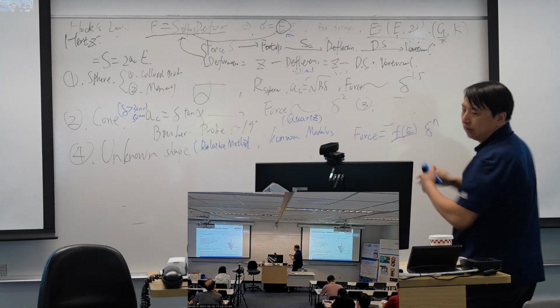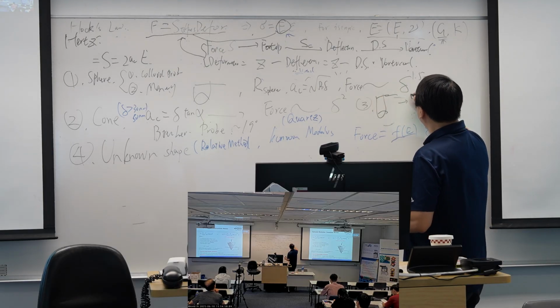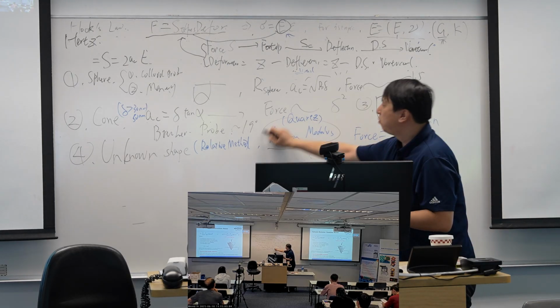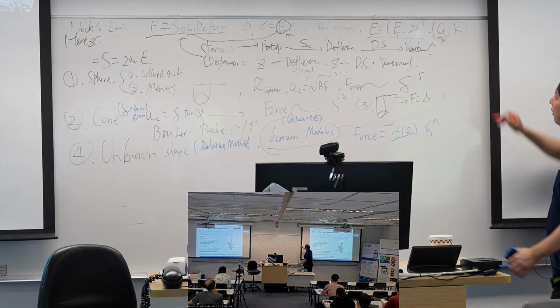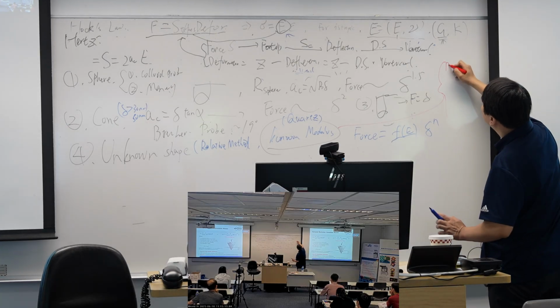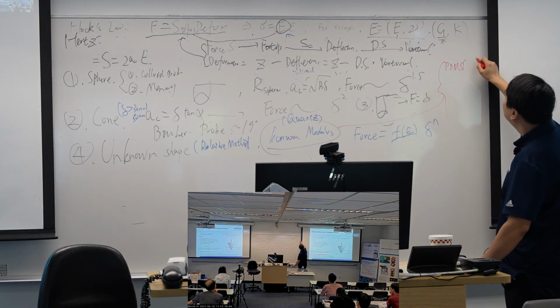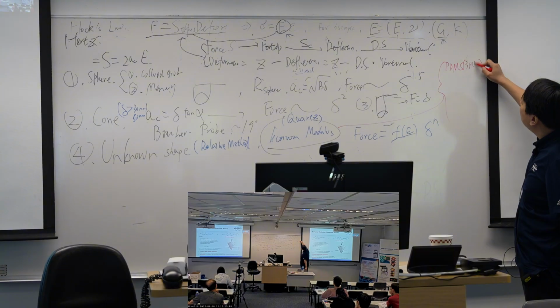First, we have some PDMS. The modulus of the PDMS has been measured using macro-scale instruments. It's about 3 megapascals or 2 megapascals.